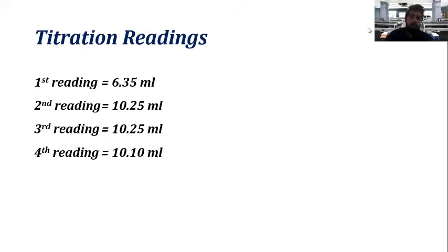Actually, with this kind of titration, we cannot get the average. That's the proper practice. Okay, you have to think. You have to understand that.